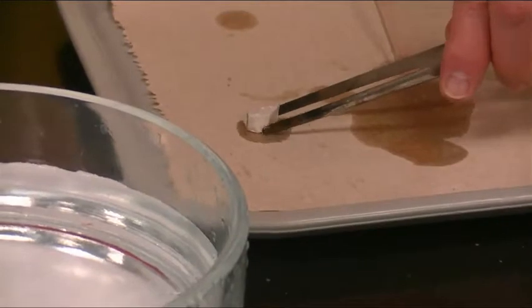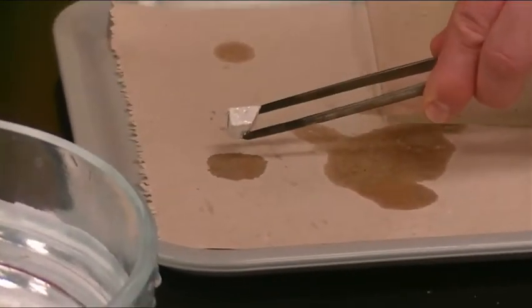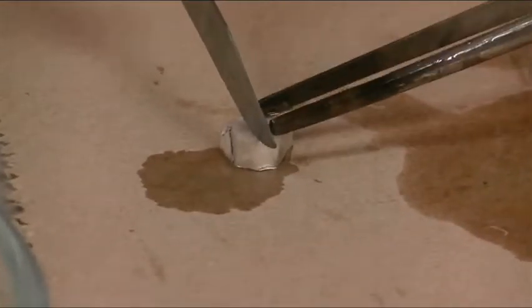So again, this is kind of a whitish metal this time. Now when we cut it, you're going to see it's going to have a bright silver on the inside like we're used to. Oh, yeah. There we go. So now I want you to see where it was just cut. Much brighter, nice silver color on the fresh part where we cut it. Nice and shiny.